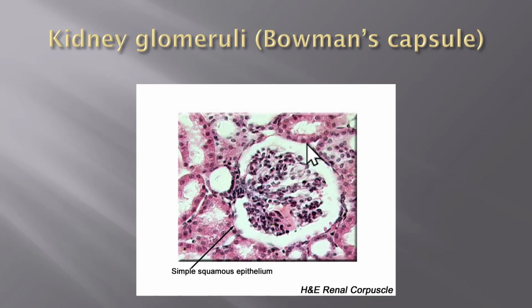When I get over here, let's go from this one. Here's our free edge. I come into this cell and I stop. I've got another free edge over here. But look at the shape of this cell. Here's the cell. It's a cube. And I don't have another layer of this underneath.